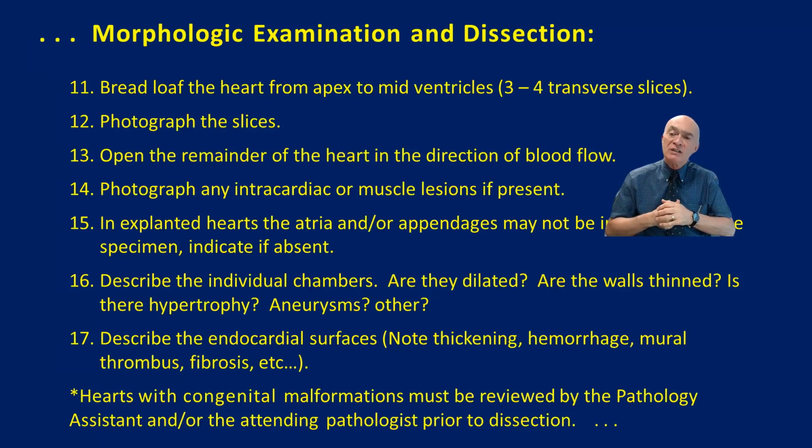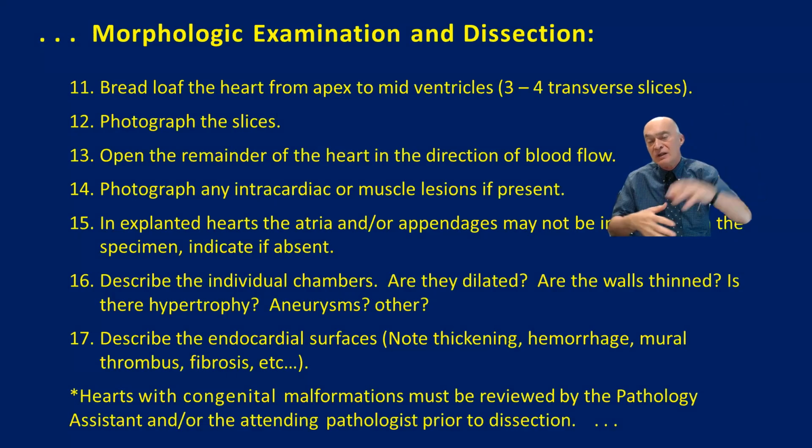Very important also, in cases that we have congenital cardiomyopathies, some of them are focused on the right ventricle most importantly, and that is the presence of fat. If you find a very significant amount of fat within the myocardial wall in the right ventricle, in most cases, in some cases you can also find this kind of fat deposition in the left ventricle as well. The presence of this fat is going to interfere with the conductivity of the signal that comes from the right atrium, and then it's going to produce blockages and also arrhythmia.